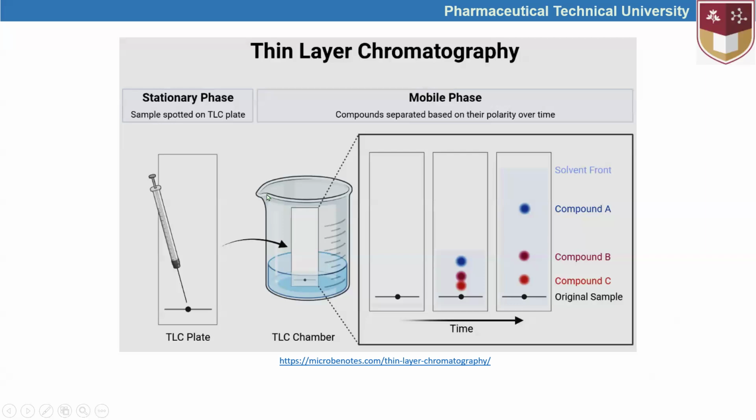It will be better if the glass is covered. Such covered glasses are recommended in order to provide a constant ratio of the volume of the eluent, which could be more volatile compared to others. It is better to provide the system protected from the air.